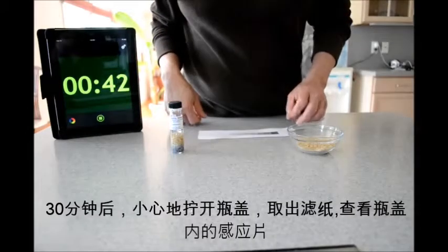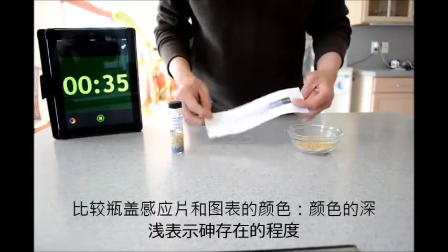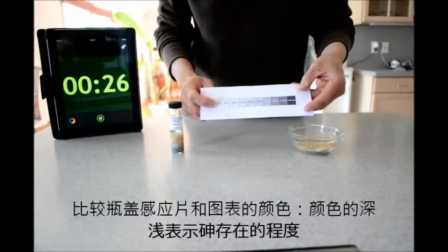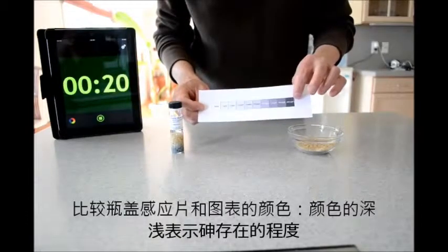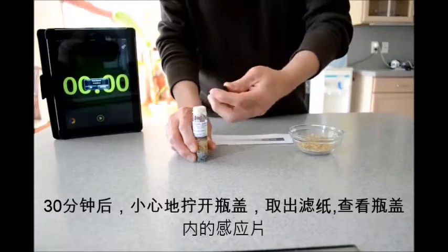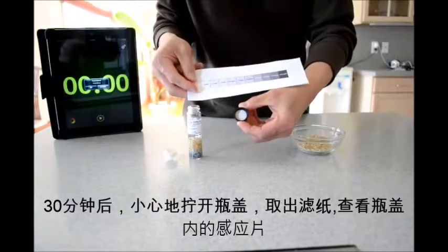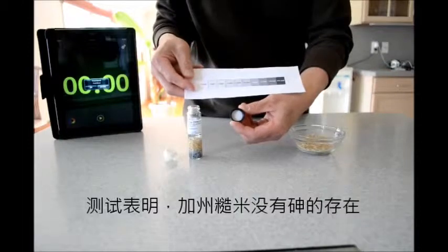Alright, we're almost at time. What we'll do is unscrew the cap and then compare what we see in the cap to this chart here, starting from 0 parts per billion for a colorless cap all the way to 200 parts per billion. As you can see, there's hardly any arsenic for this brand of rice, so this brown rice is pretty safe compared also to the white rice we tested before.